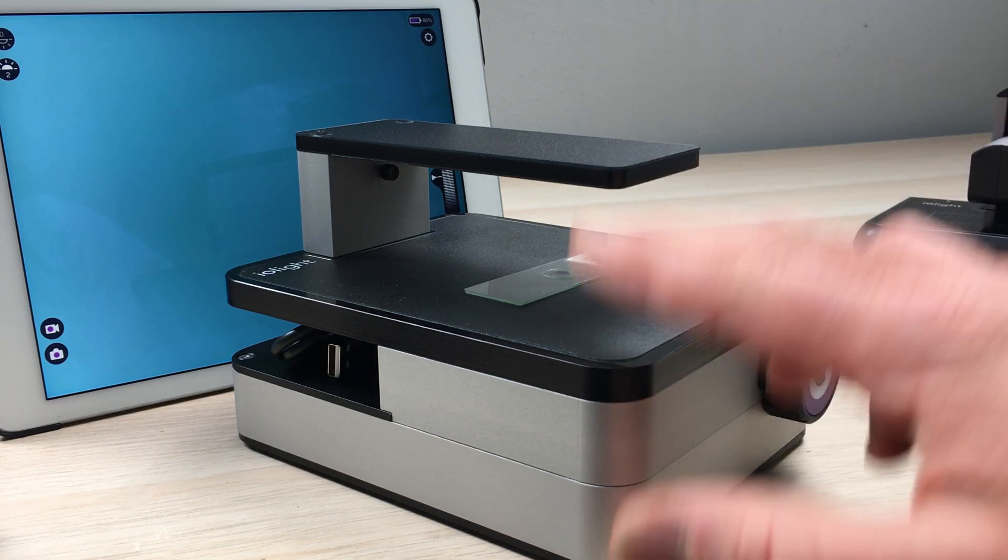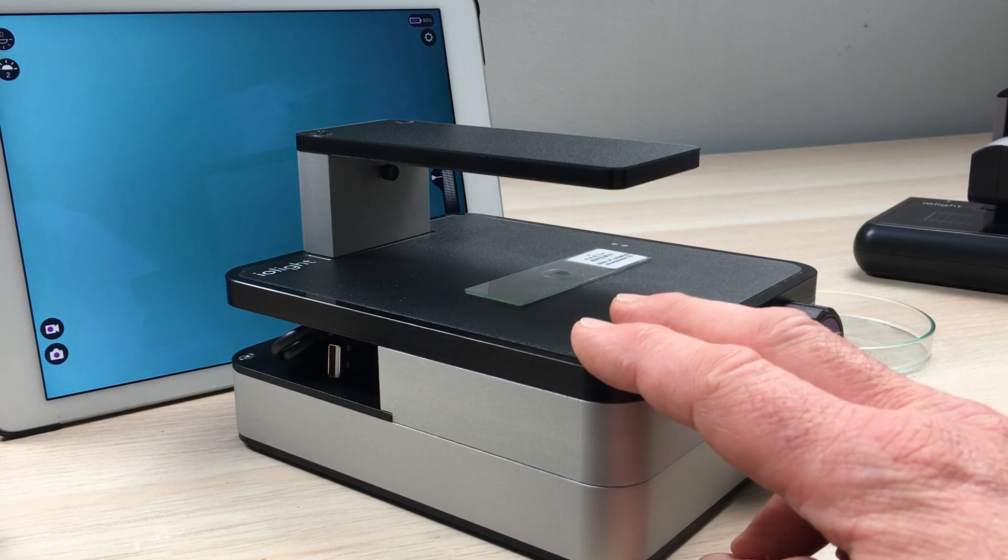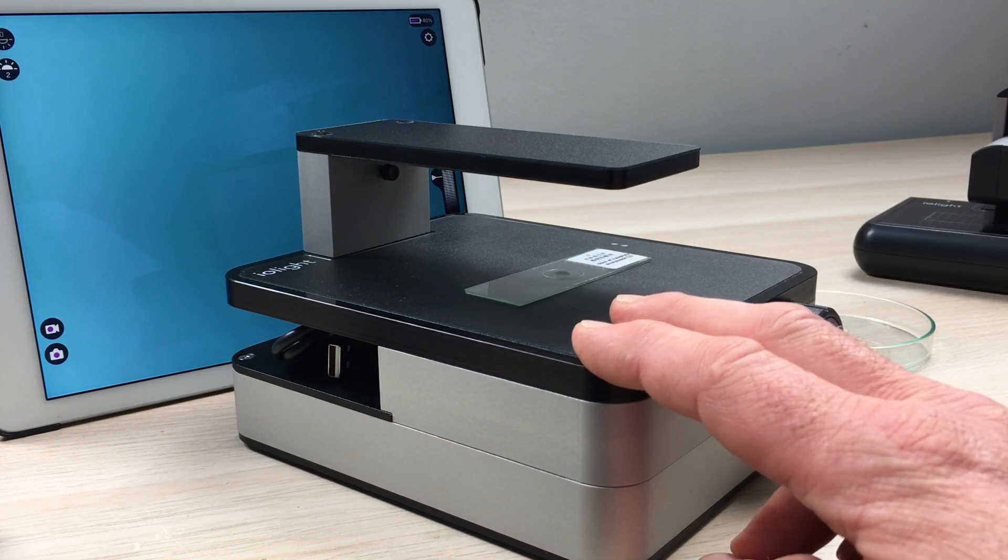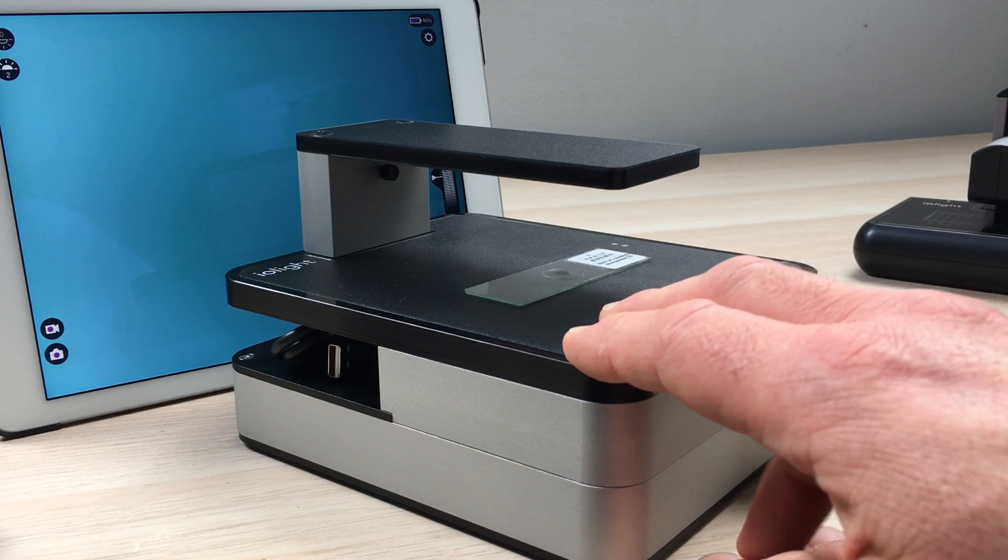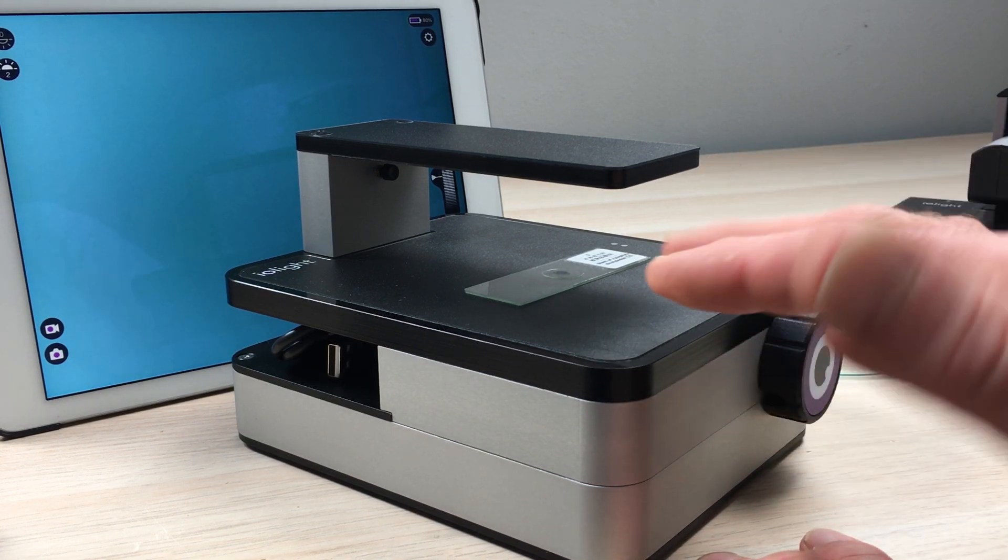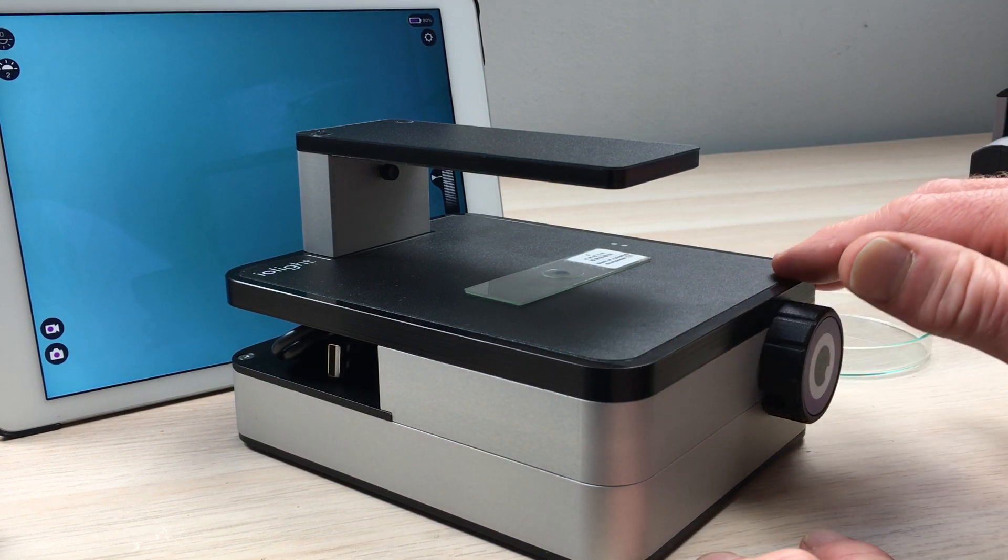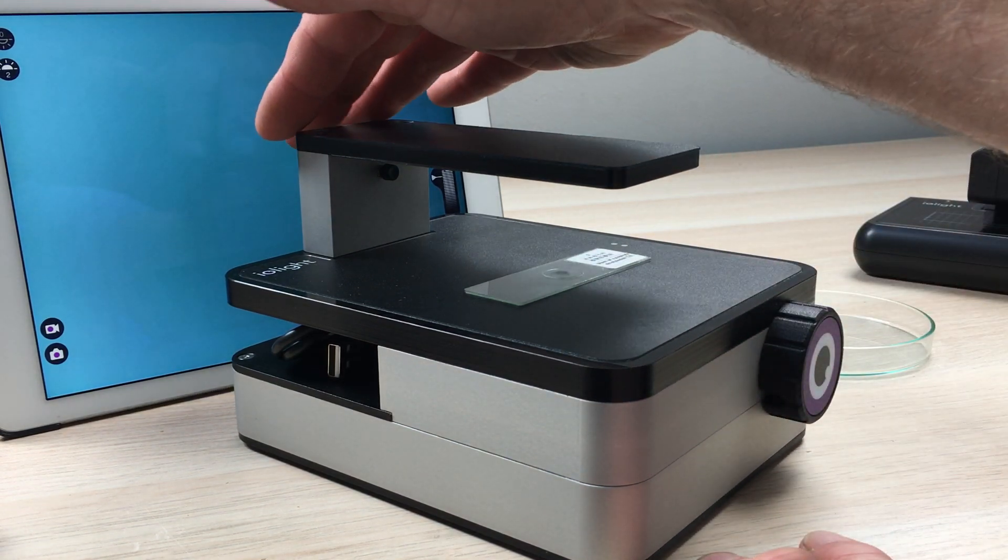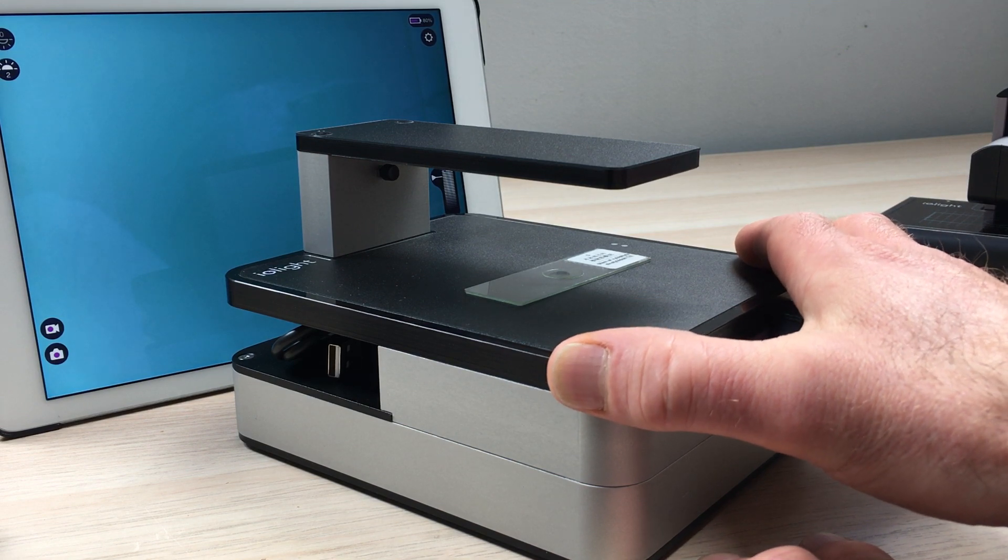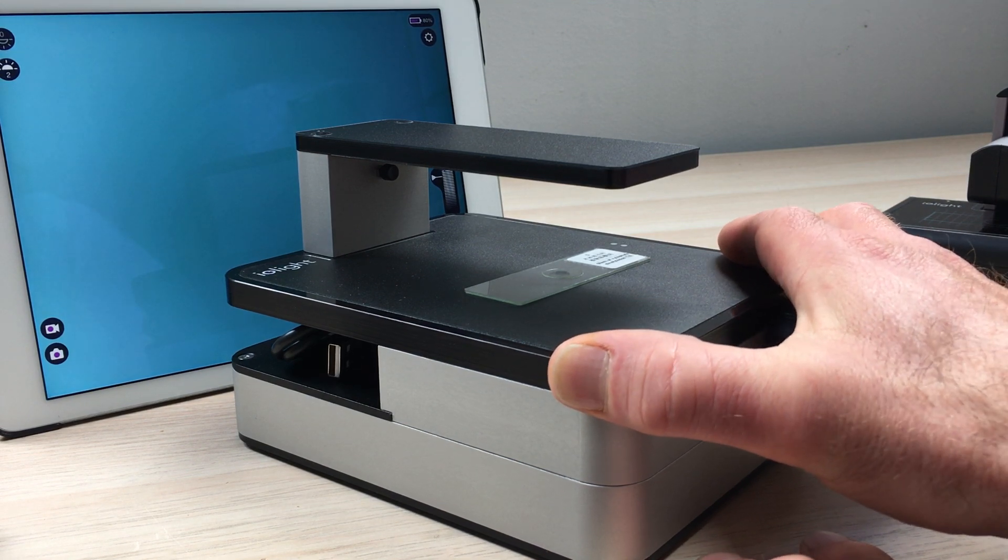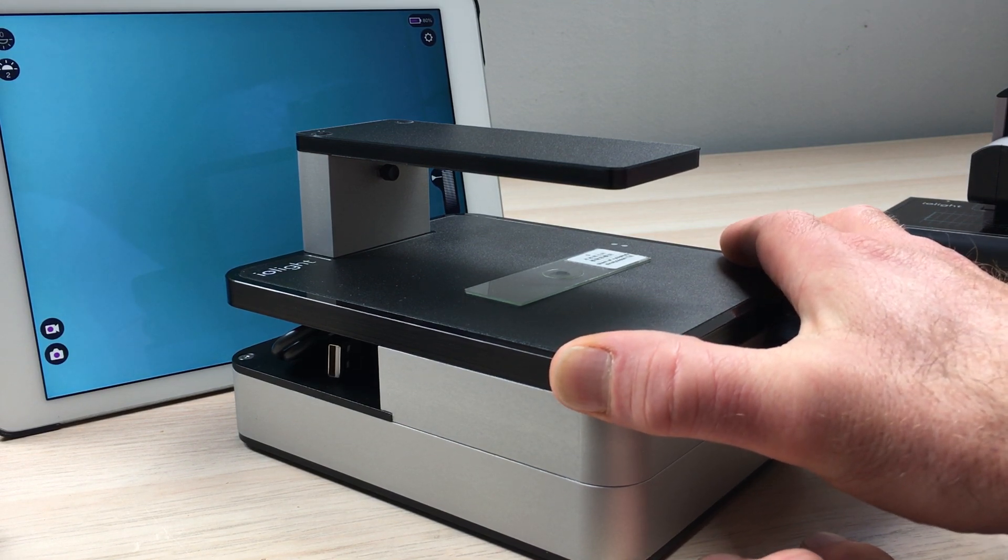This microscope is sealed so you can use it inside an incubator, even a CO2 incubator, and it works well with the very warm and wet environment within that incubator.